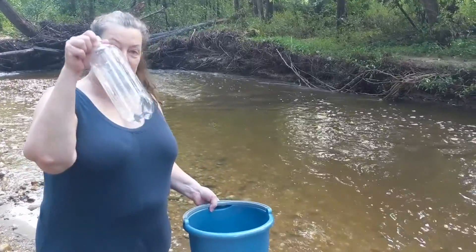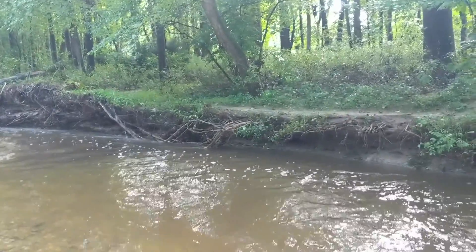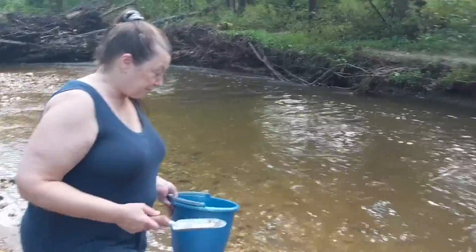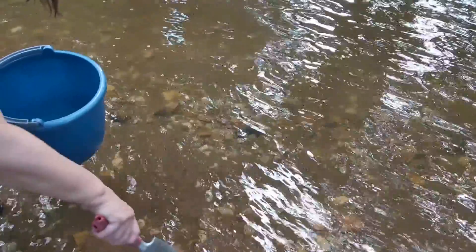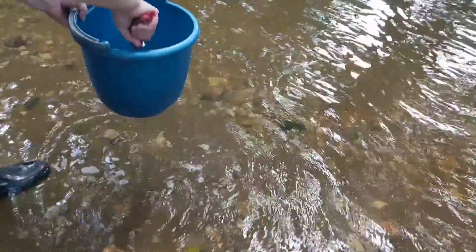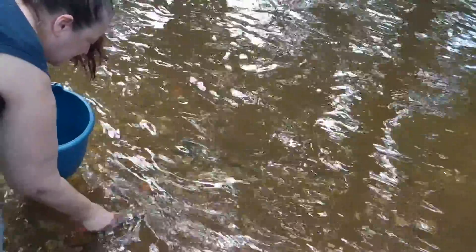I need as much sediment as will just about fill this bottle. Remember that we're going to remove any stones, rocks, or sticks, so you can get a little bit extra. You can see the silt, sand — any of this sediment will be just fine. We are going to take out those rocks when we sift it.